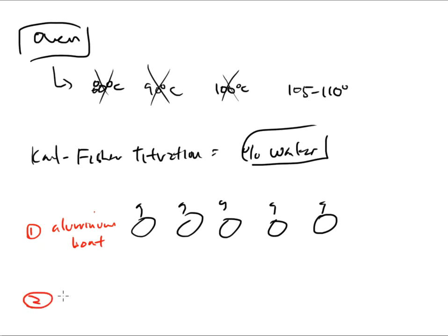When you remove them, folks, you want to make sure that you put them into a desiccator. All right, so what is a desiccator? A desiccator is this big, large, heavy piece of glass with a lid, and there's a chamber down here kind of at the bottom, and there's a lot of crystals down in the bottom of this desiccator as well. The purpose of the desiccator, folks, LOD is measuring moisture mainly, right?